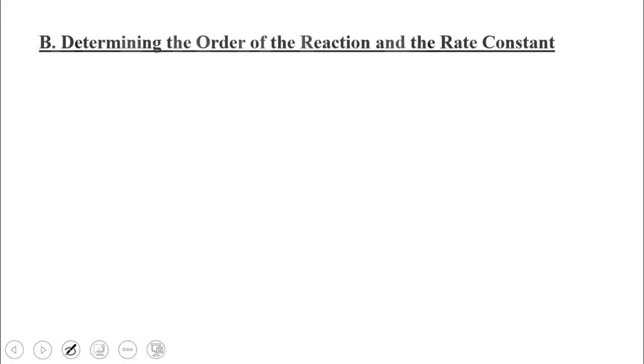Okay, now, moving on with calculations, and again, none of these calculations need to be performed during the lab time.